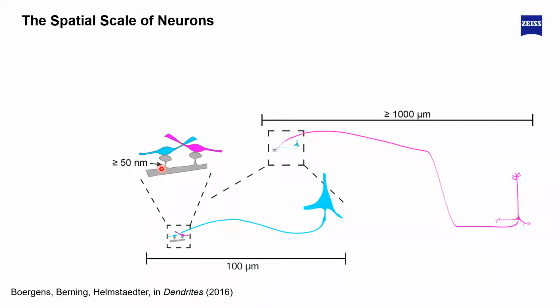So you might think about, I would say not recent anymore, but over the last 1 to 2 decades, super resolution light microscopy comes to mind, right? And they are really pushing into that field of around 50 nanometers. That is great and could get you there, but the challenge is again the density of those synapses that are formed, right? So here within a very small space, we already have 2 synapses and 3 cells that we would also have to label for light microscopy. And that's eventually the challenge.